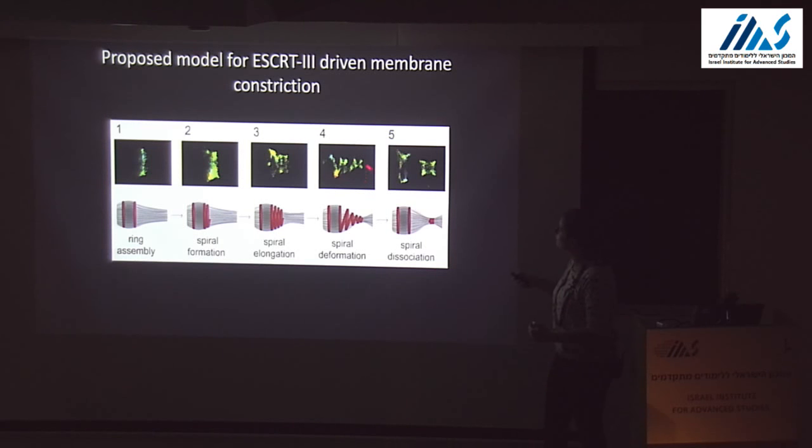You see that this is probably under a lot of tension, and we think that this is because it is still bound to the scaffold here at the center, but it is free to relax and constrict on the edge. And I will just say that we think that this involves microtubule severing. And then eventually, because this form is under a lot of tension, it breaks or depolymerizes, and then we end up with two pools, one that is stuck to the scaffold of the other ESCRTs, and one that is constricting all the way to 200 nanometer. So this is 200 nanometer. This is not full fission.